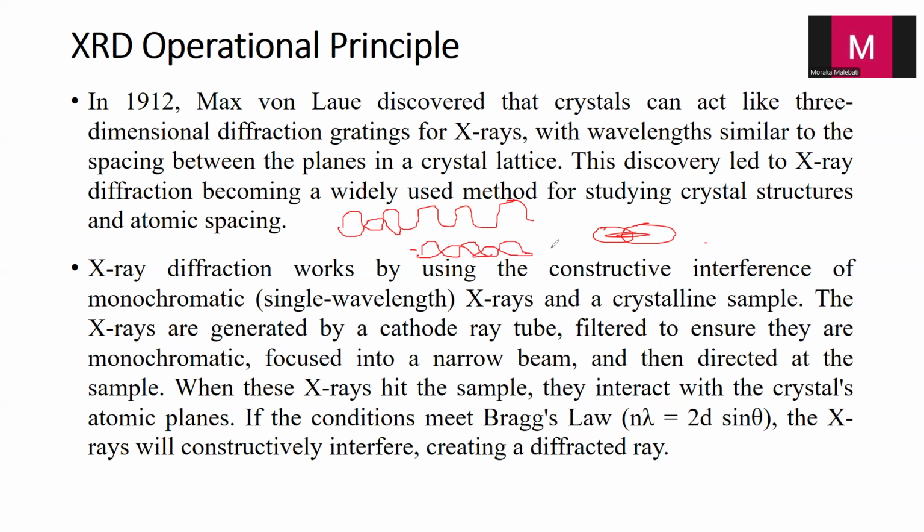Okay, better. So we know that these waves will cancel each other out, and we would have a straight line, because they are out of phase. This is what we call destructive interference. But if the waves are like this, they cause what we call constructive interference.